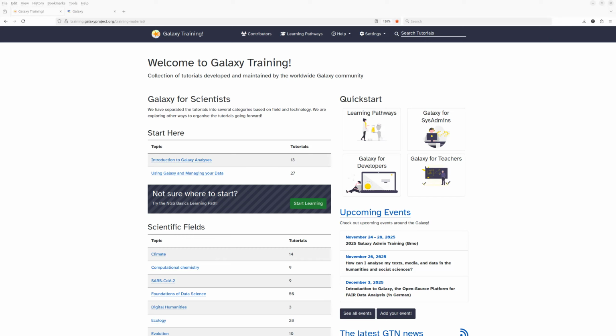I'm working for the Freiburg Galaxy team, and today I want to do the Galaxy introduction from peaks to genes with you. Currently, I am on the Galaxy project training material website, and here you see under Start Here the topic Introduction to Galaxy Analysis.